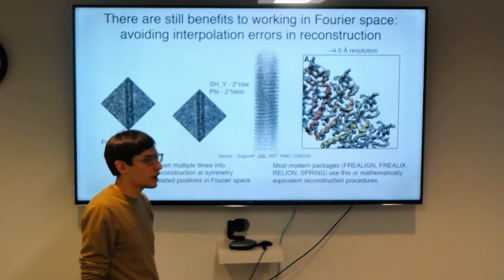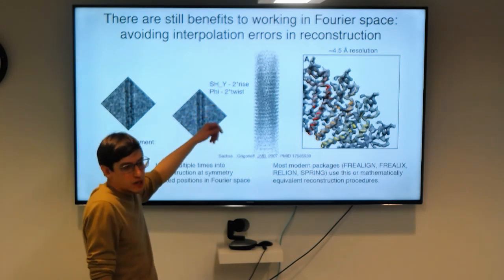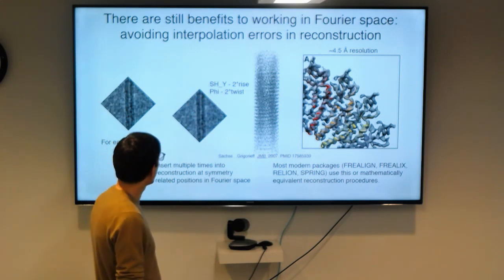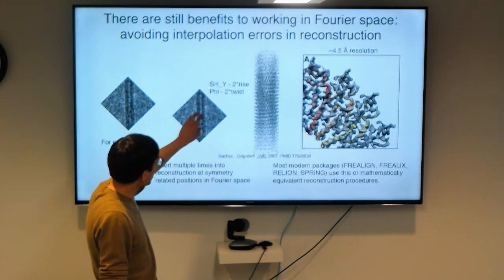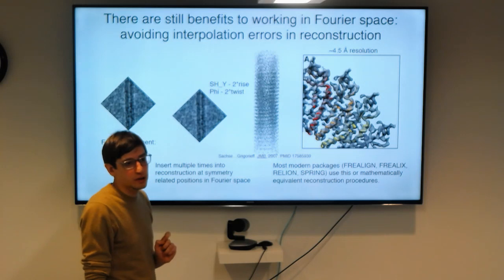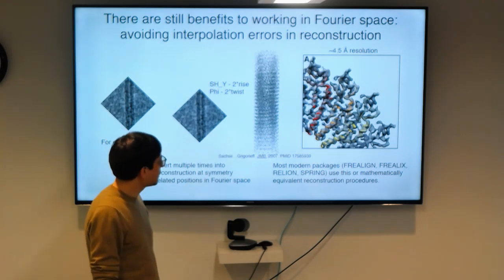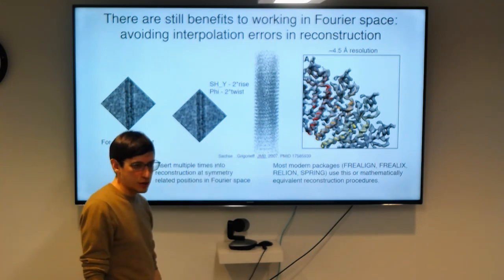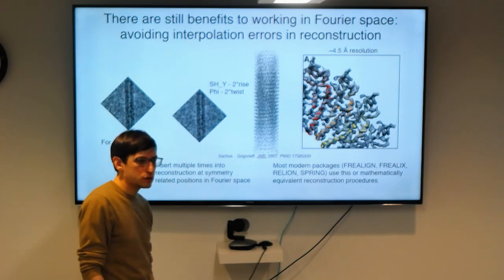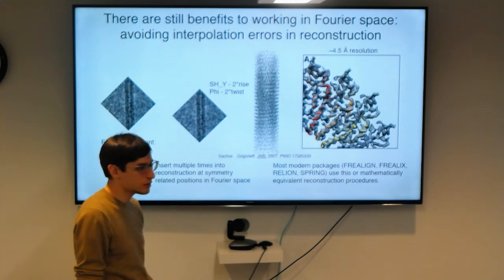So that's another source of artifact. But yeah, this only works if it is actually a symmetric helix. Otherwise, you'll get all sorts of artifacts. But otherwise, if you do have the helical symmetry, you definitely want to use it, because it will really dramatically improve. You basically amplify your data by the number of asymmetric units you have in each. So it's kind of similar to icosahedral viruses, for instance.